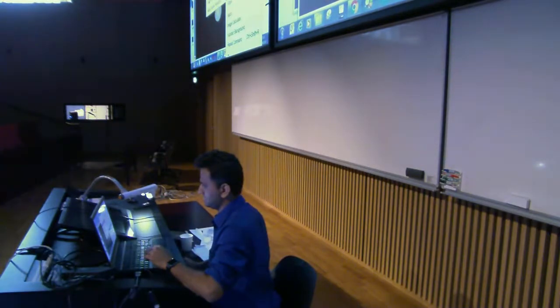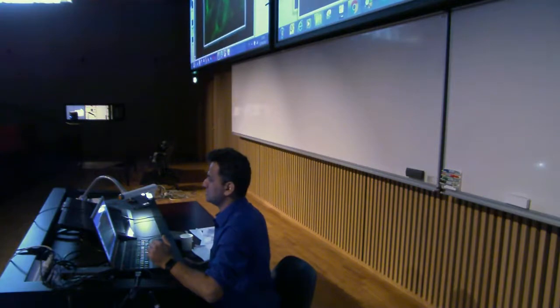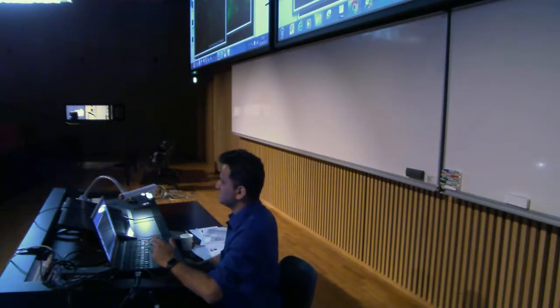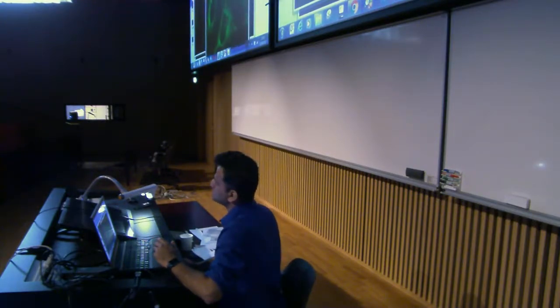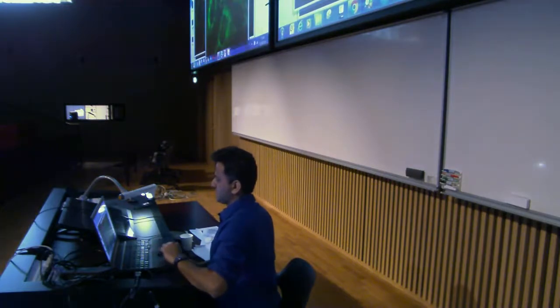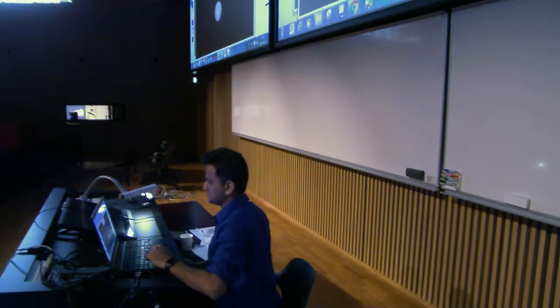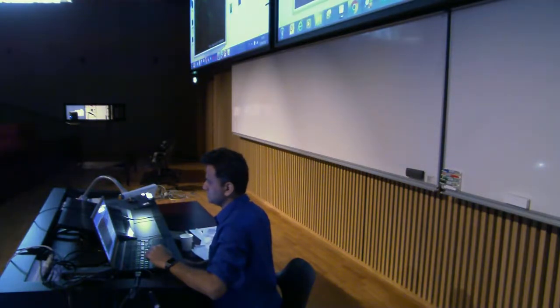Process, FFT, inverse FFT. See now? So this is the low frequency component of this image. This is basically nothing but doing this Gaussian convolution. What we have done here, process and smoothing multiple times, you would get the same thing actually. So this is all about the pre-processing in both spatial domain and the frequency domain.